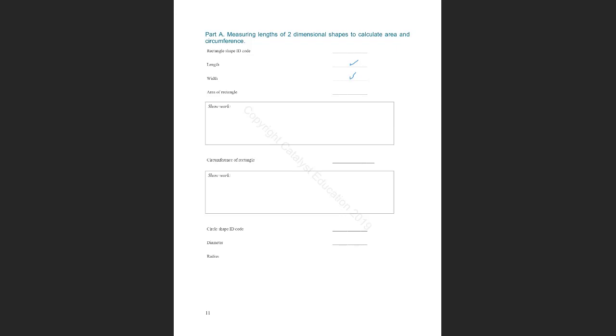So does it make sense? Stop me if I'm assuming that. It does. It makes sense, especially if they're going to give it to us. Exactly. They will give it to you. So just to give you an example, it will be in red, 8.78 centimeters.